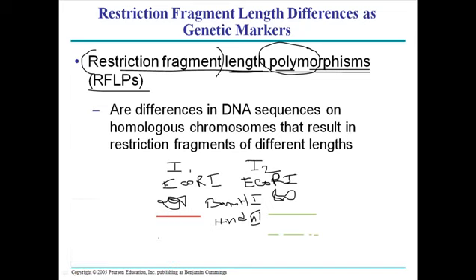In individual 1, using the same sets of enzyme, we end up forming these divisions. So the same sets of restriction enzyme, but they make a different number of copies of DNA. As we know, a restriction enzyme can cleave at a specific site of the DNA. As we know, between two human individuals we have very much similarity, above 99%, about 99.99% similarity between two individuals.